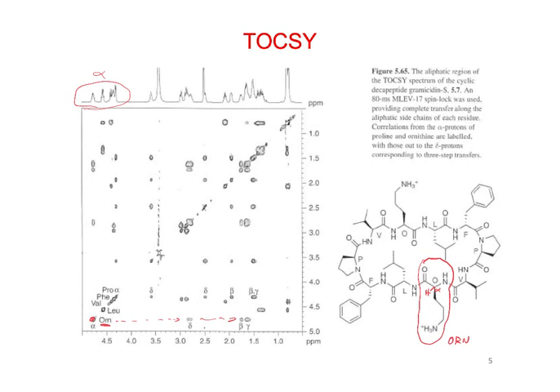Here's alpha, here's the beta, gamma, here's gamma, and here's delta. So we see all of the signals for that amino acid in this line right here. It's not really telling us what amino acid is connected to another amino acid, but that's going to be true for all of the different amino acids here. They should all have lines going across like this.